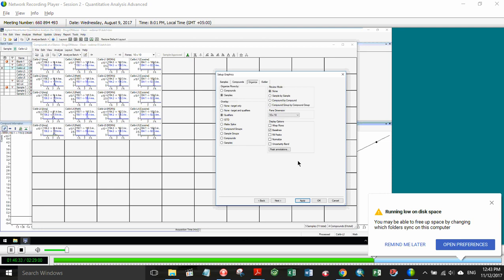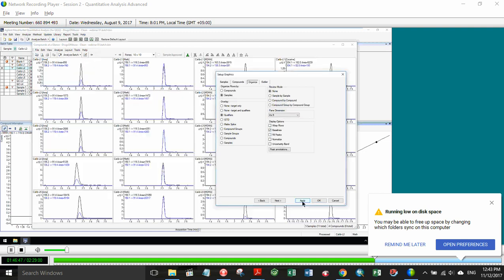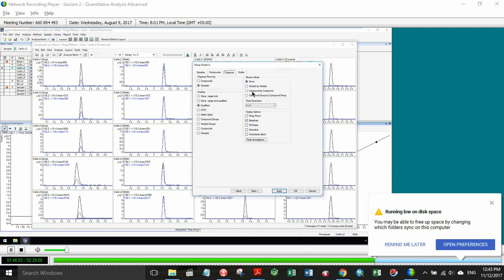On my display, and certainly I'm sure on what you're seeing, that probably wouldn't be terribly usable, but I do see that probably a 4x5 would be good for me. So let me set that up here. So it's a nice little dialogue here. All right. So there we go. It kind of tightens it up for what I'm looking at.